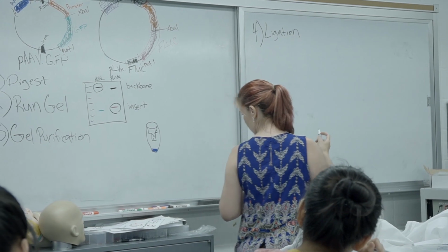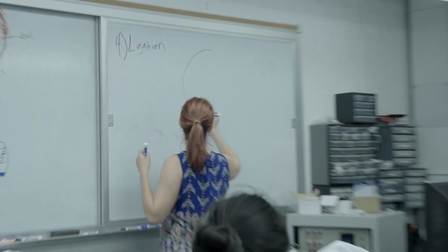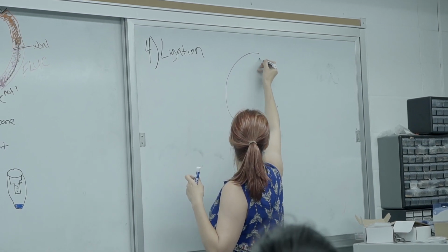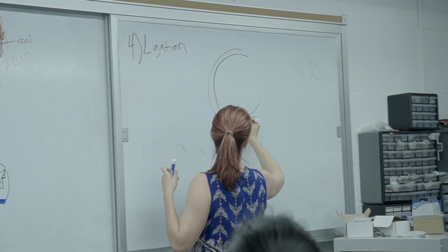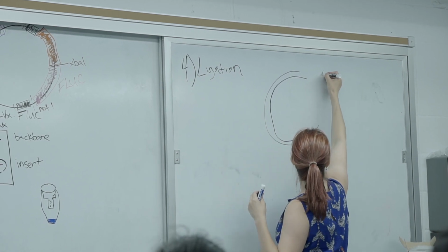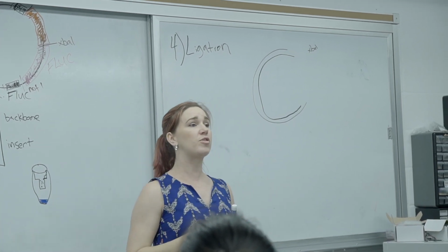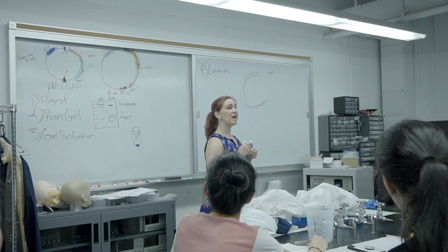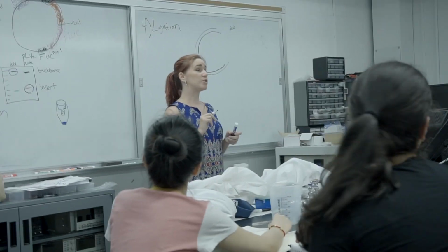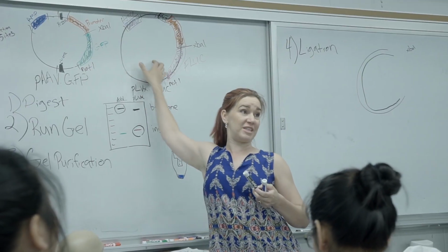So that's a perfect lead-in. So I don't remember exactly how they cut, but the plasmid's actually a double-stranded DNA, right? So here's my backbone, and did you guys discuss restriction enzymes and sticky ends? Yeah? Great. So if I use my XbaI one up here, let's say, and DNA goes what direction? There's a 5' and 3' end. Yes? You were saying that you choose the same restriction enzyme? There's ways to do it if you don't use the same restriction enzyme, but I'm going to explain why it's best if you digest both of these with the same enzyme right now.